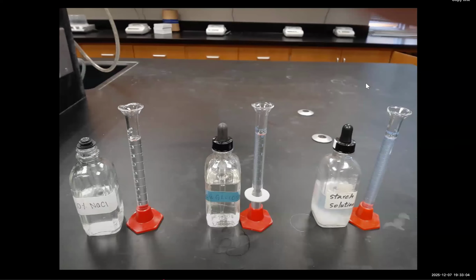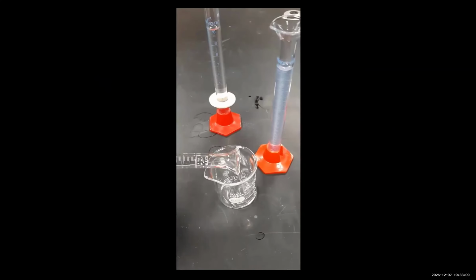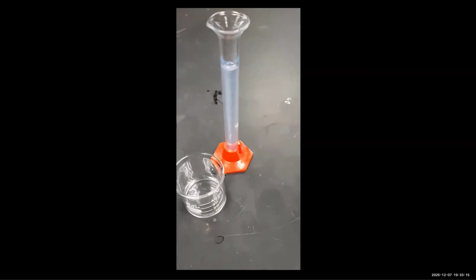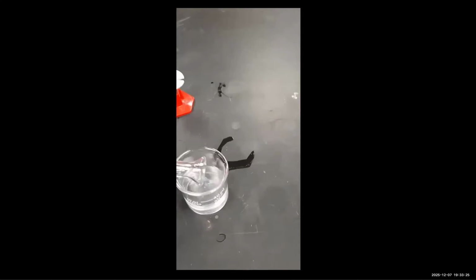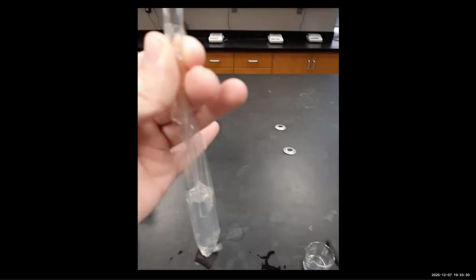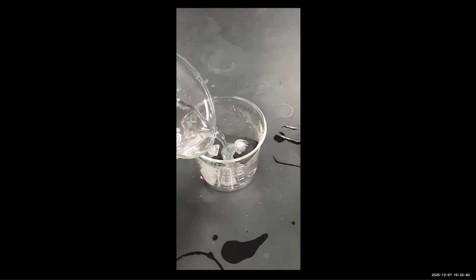Okay, so here's the sodium chloride, glucose, and starch solution. They're mixing them all in a beaker. This is what's going to go inside the dialysis bag. So the sodium chloride, glucose, and starch solutions are mixed. Okay, now they're loading that solution into a dialysis bag. So here's the dialysis bag, and here's what the sealed dialysis bag looks like.